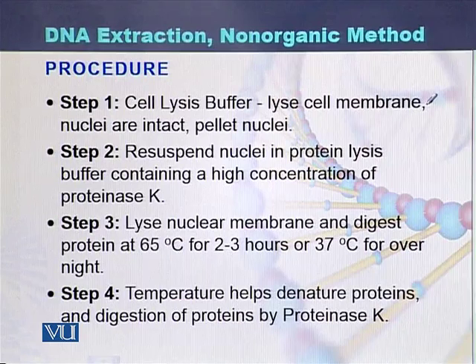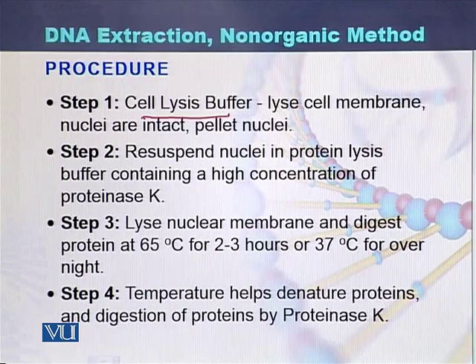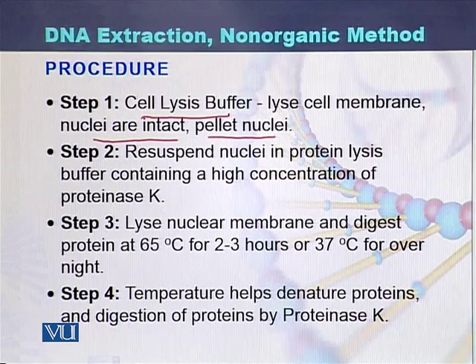During this procedure, the first step is the cell lysis buffer. With the help of this buffer, the cell membranes of the cells of the blood sample are broken, while the nuclei are intact. So, as a result of the first step, we are left with a pellet of the nuclei. This is done by adding the cell lysis buffer and then washing the blood samples.